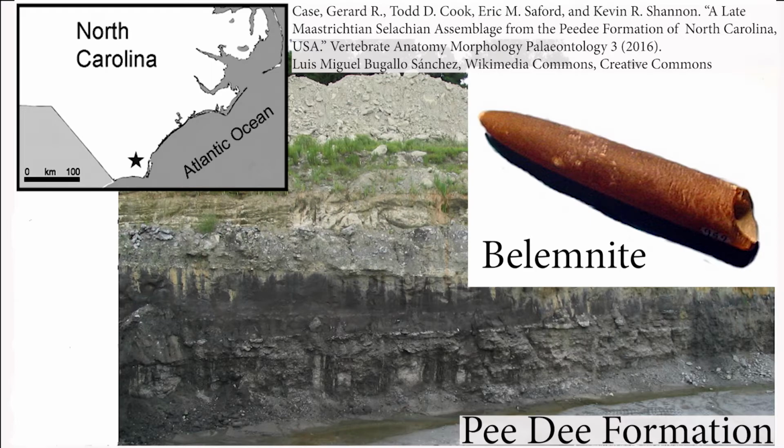So if you want to do carbon isotope ratios, you get a PDB standard, and you say, okay, my thing has a carbon-12, carbon-13 ratio of this. How different is that to the PDB? And we call that the carbon shift, the shift in carbon-13 ratio. And it's always going to be negative because compared to the PD belemnite, everything else on Earth has less carbon-13 in it. That's the official carbon-13 standard. It turns out they don't have any more PD belemnite left, so they've had to make an artificial standard. But everything else has a standard as well. Nitrogen has a standard, oxygen has a standard, hydrogen has a standard, etc., etc.